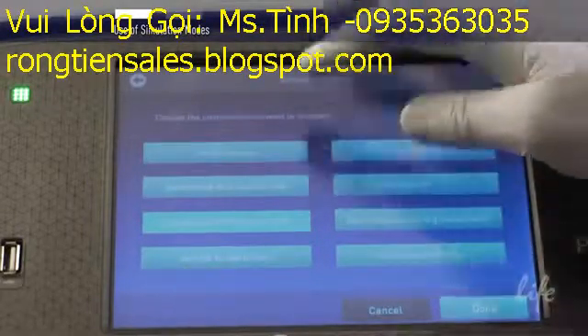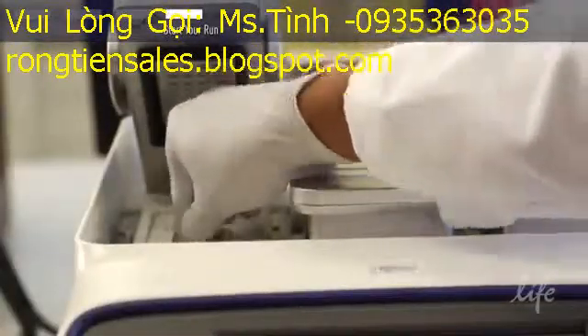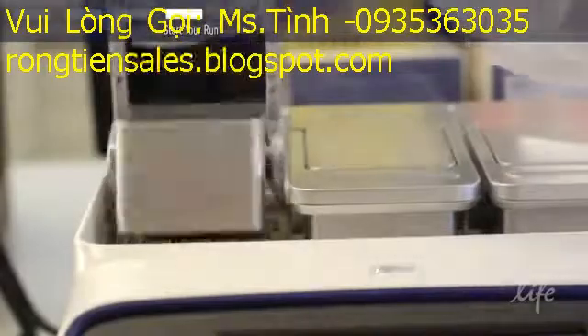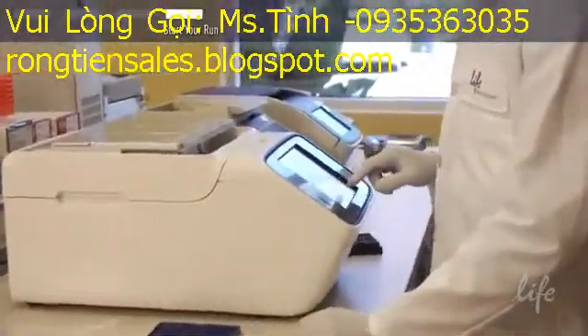You will be asked to confirm the block you will be using as a final step. Prepare your samples and load them into the block. Press the Start Program button and your run will begin.